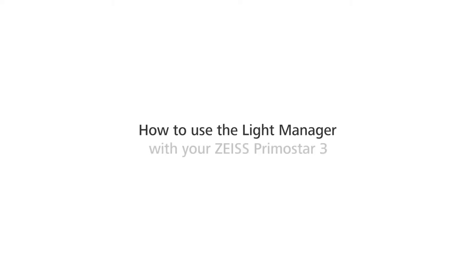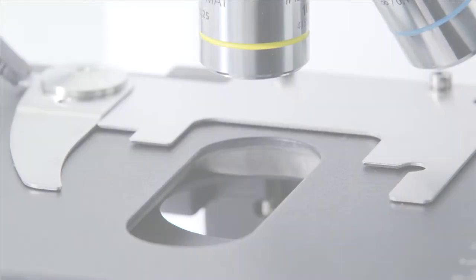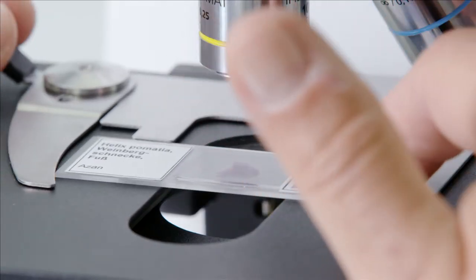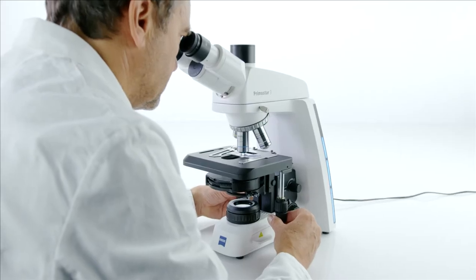How to use the Light Manager with your Zeiss PrimoStar 3. Often, working in routine labs, you will be examining many similar applications.